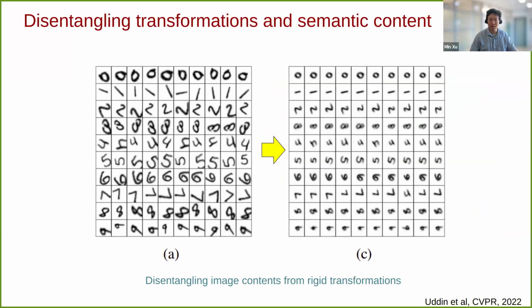We further explored methods that may potentially be used for macromolecular detection and recovery by disentangling rigid body transformations and semantic contents of subtomograms. Disentangled representation learning is a widely discussed problem nowadays, which aims to learn data representations that have one-to-one correspondence to the ground truth generating factors. In many real-life image analysis applications, including Cryo-ET and Cryo-EM, the objects of interest undergo multiple transformations that alter their visual properties while keeping the semantic content unchanged.